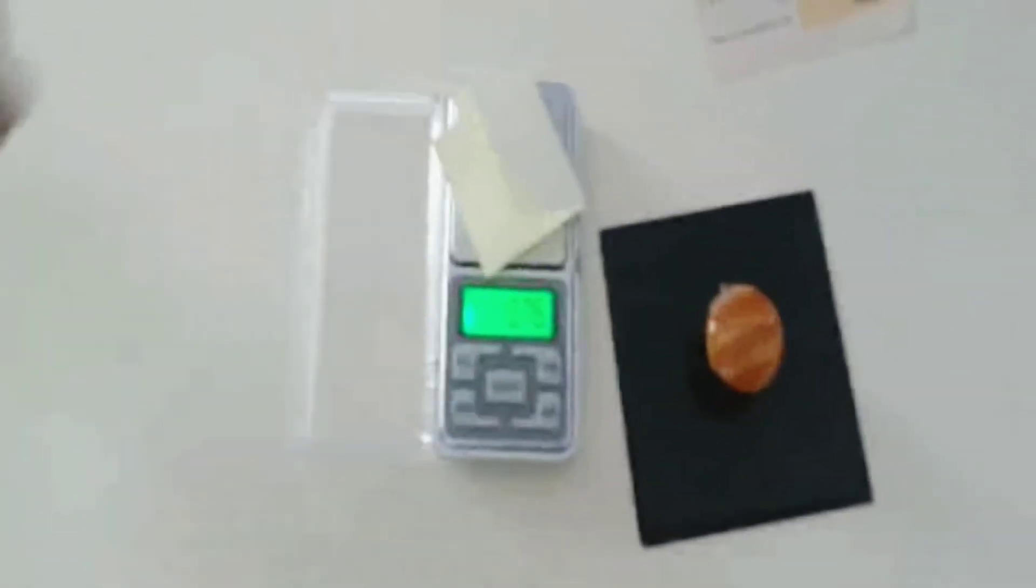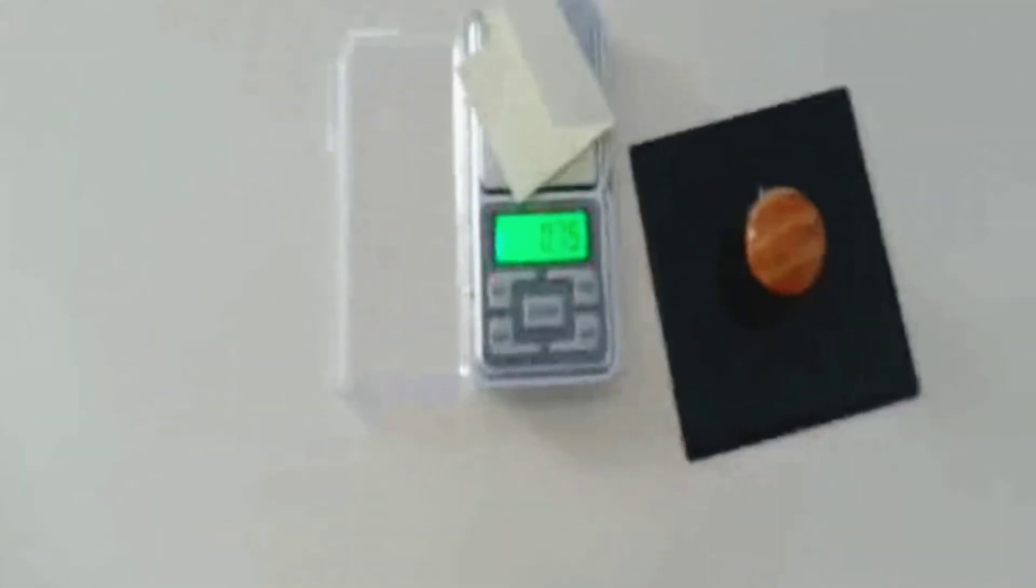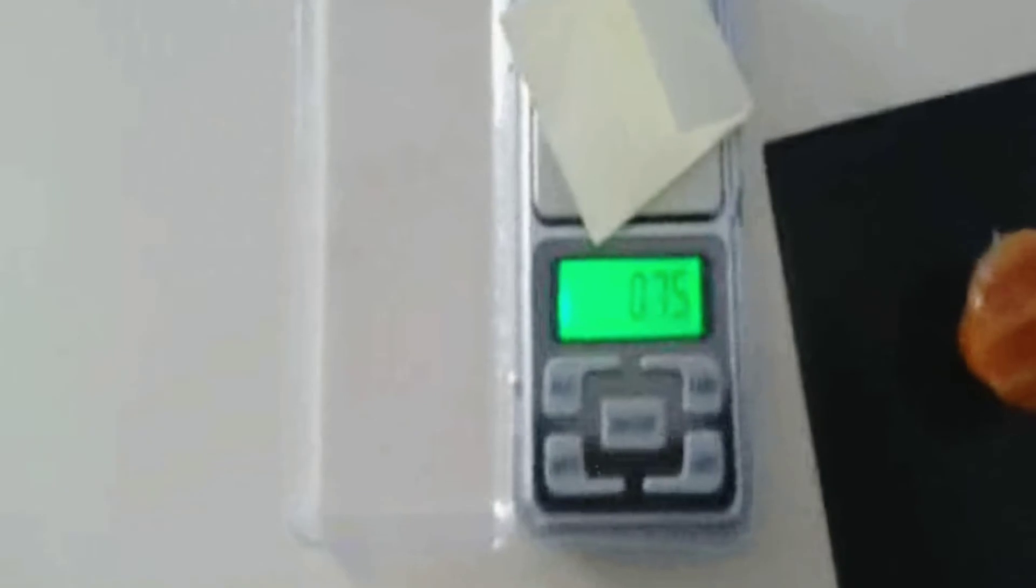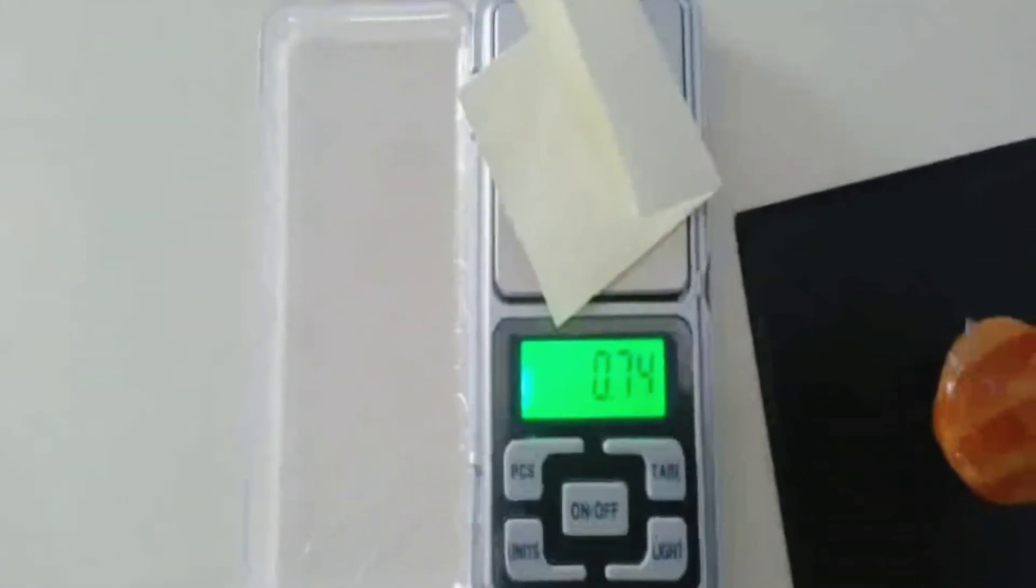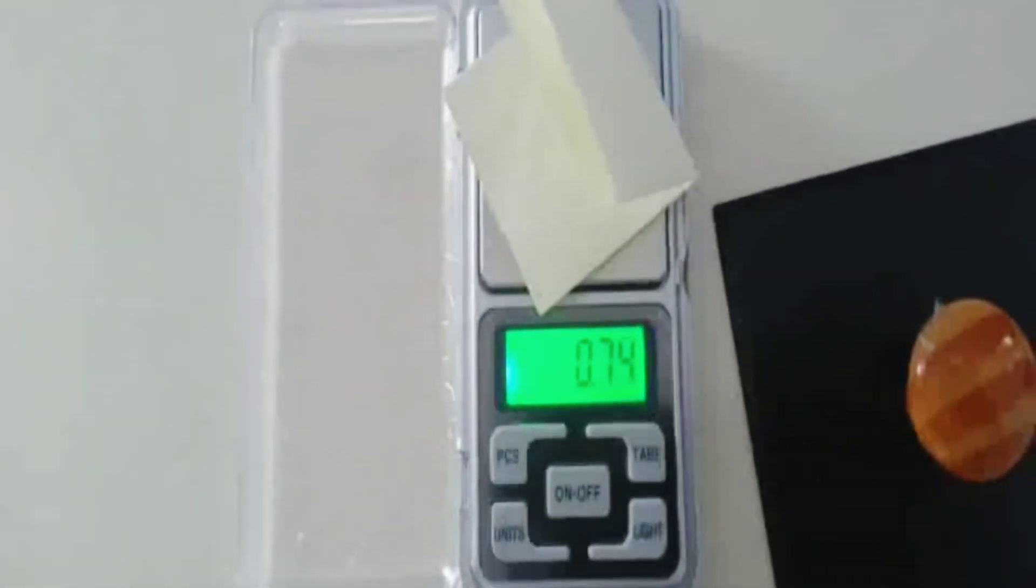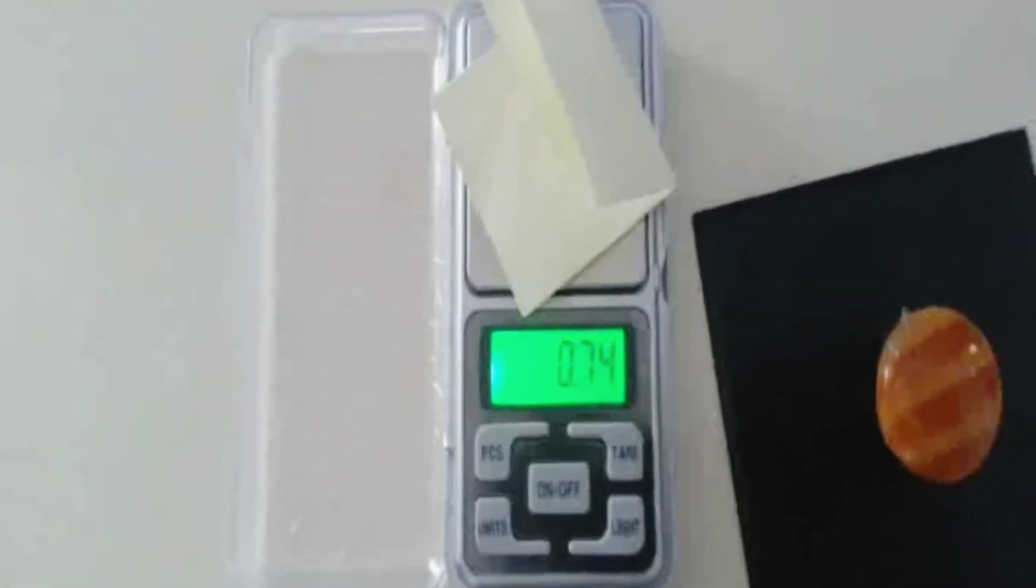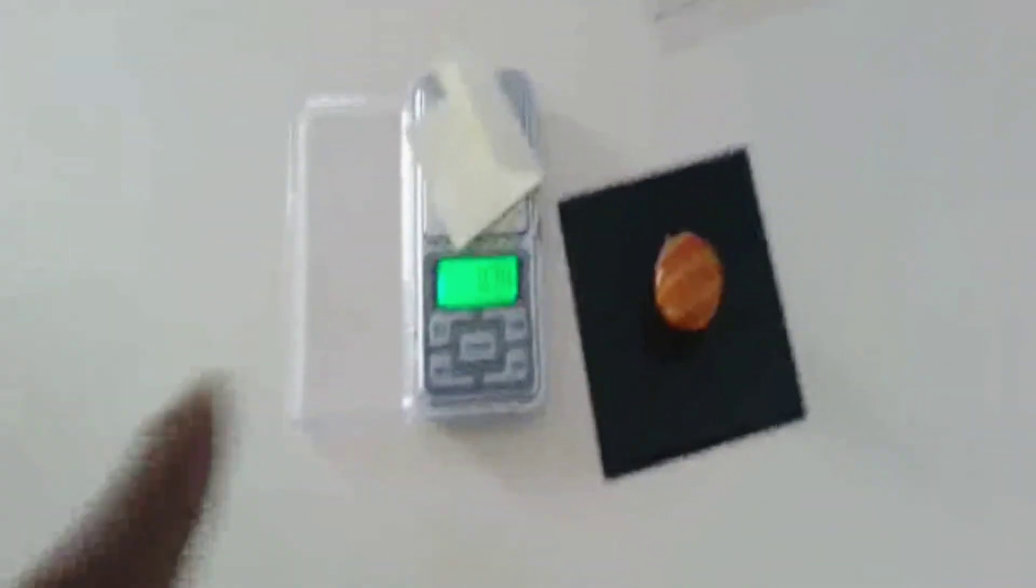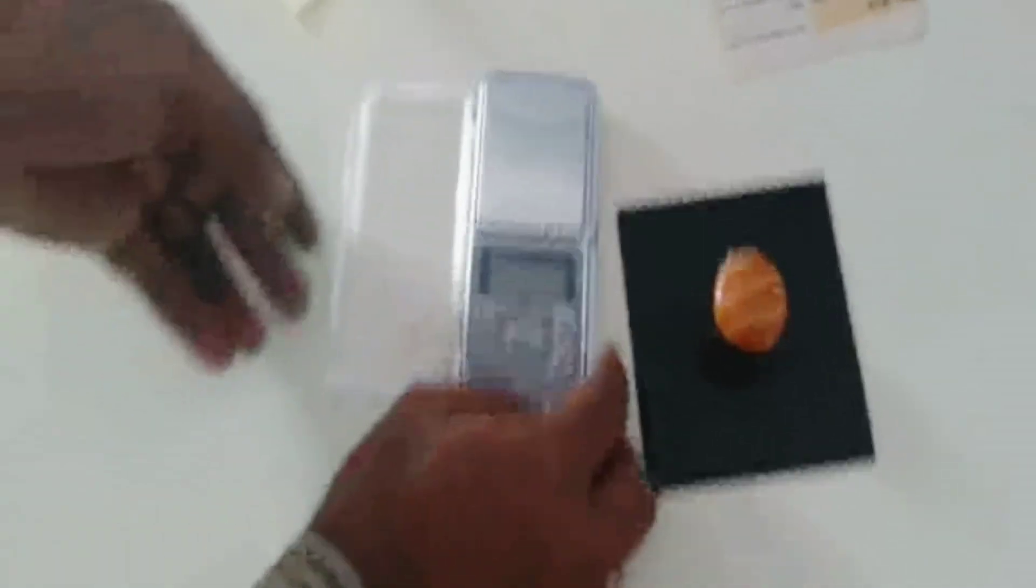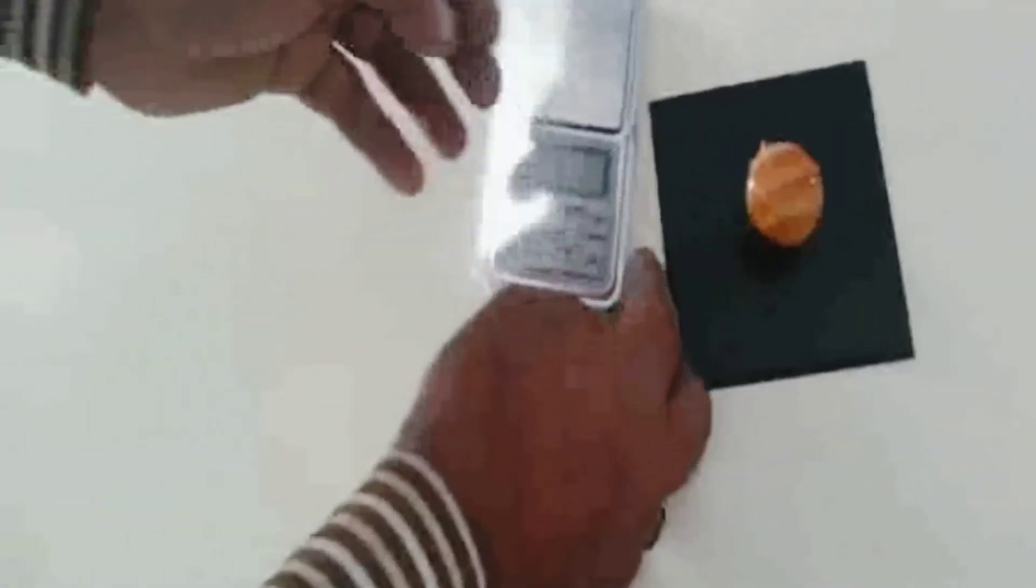We can directly put that sample over the pan. This will directly show you the GSM of that paper. This is 74 GSM. Only one button is in use, other buttons are not in use.